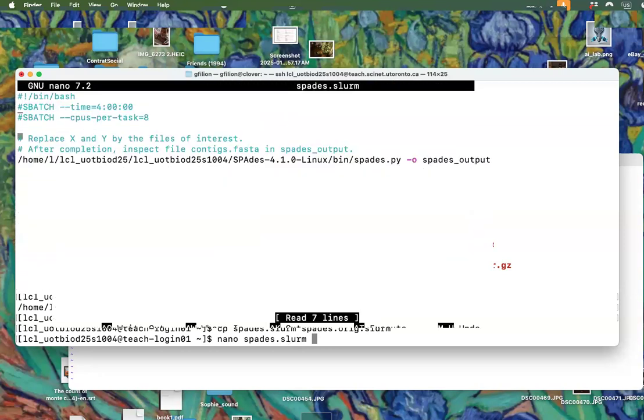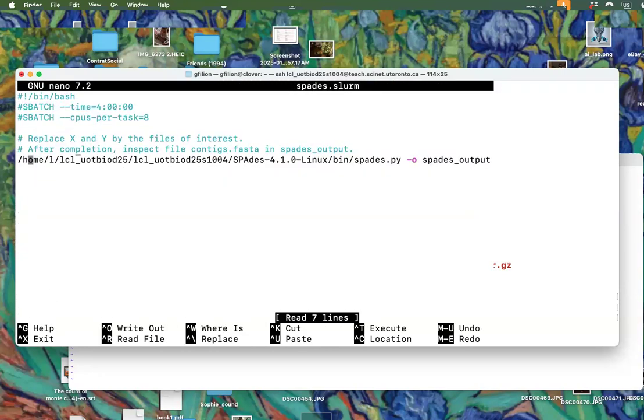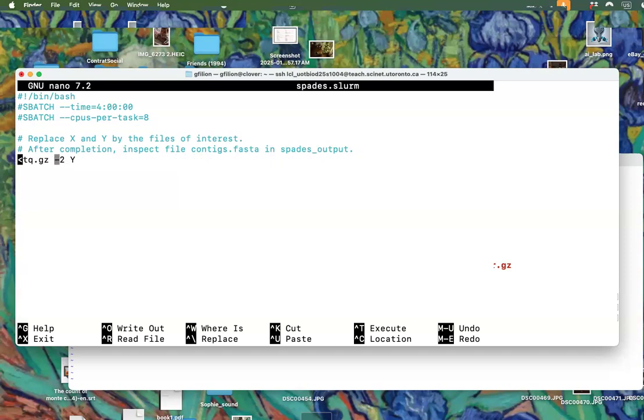So you have this usual kind of oldish interface for nano, and you've got to go till the X, where you replace it with basically the name of the file that it should be. So that's mystery1.fastq.gz. Then it's a bit annoying. It's too long for the screen, so it does this, but nothing to worry about.